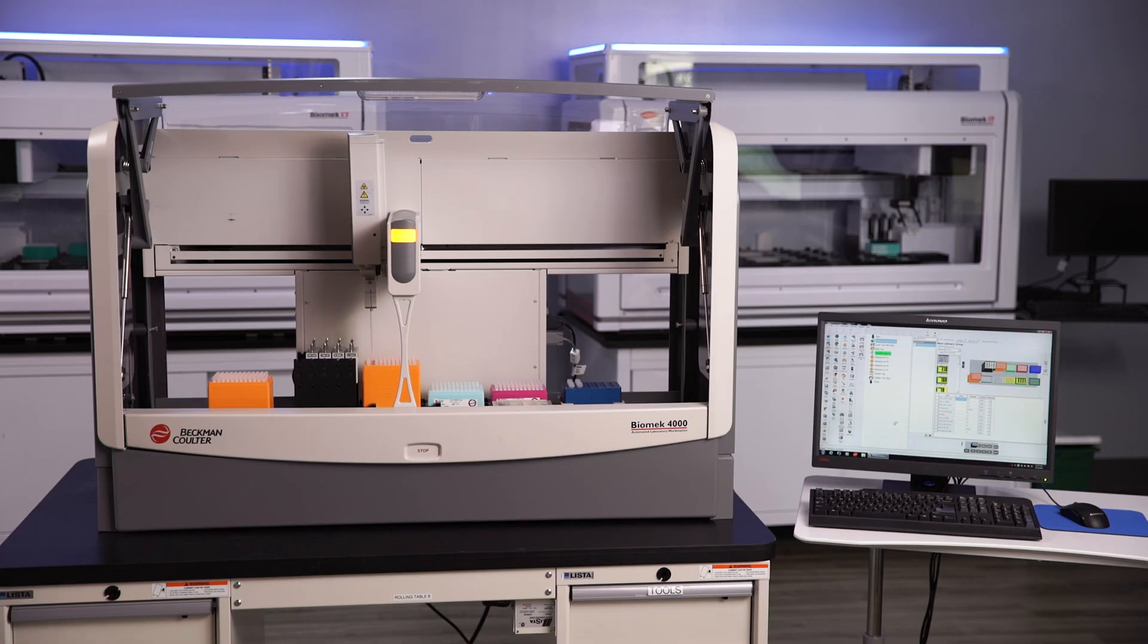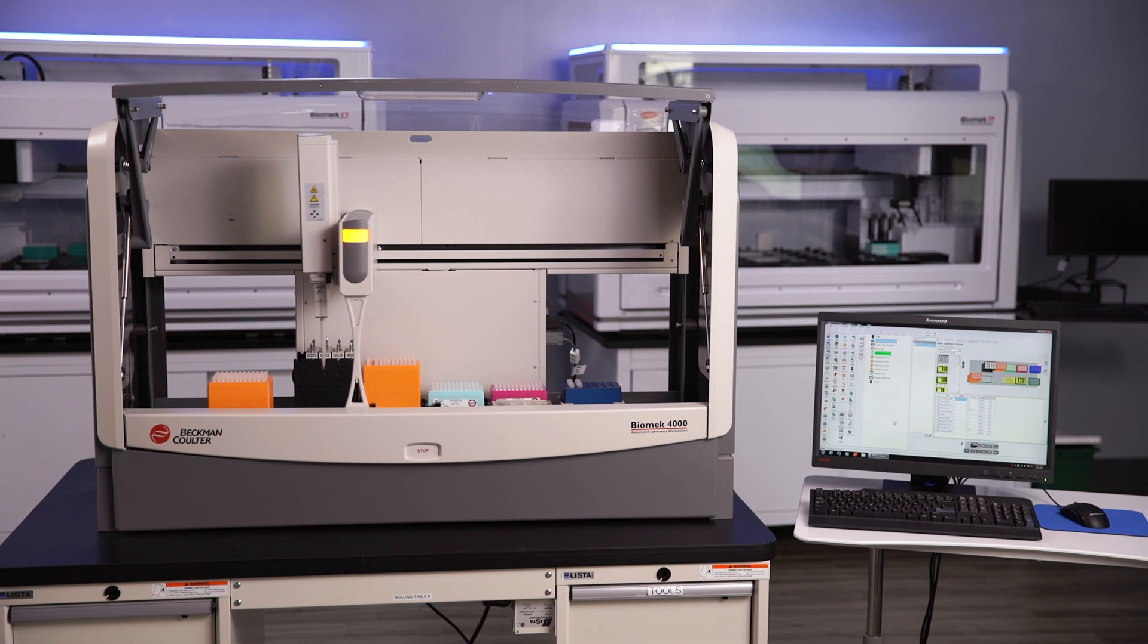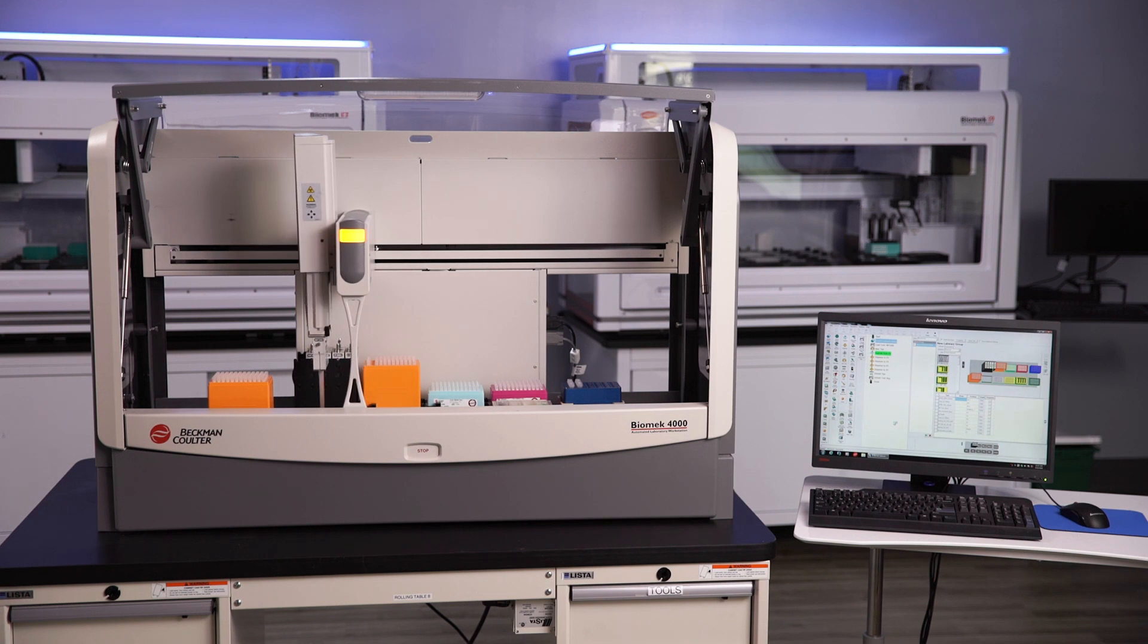Reliable, efficient, and easy to operate, the Biomek 4000 is the next logical step in lab automation.